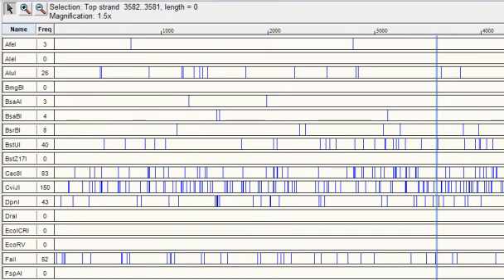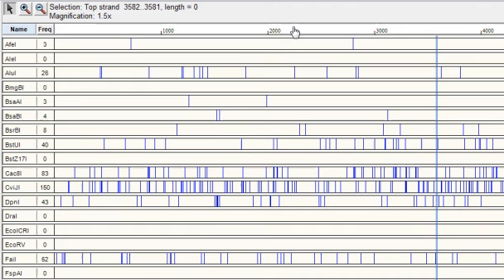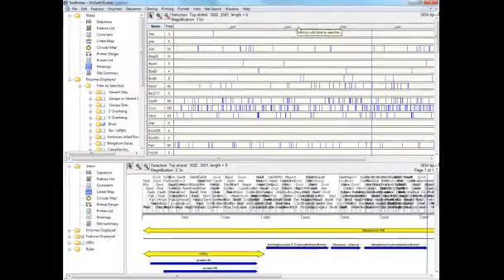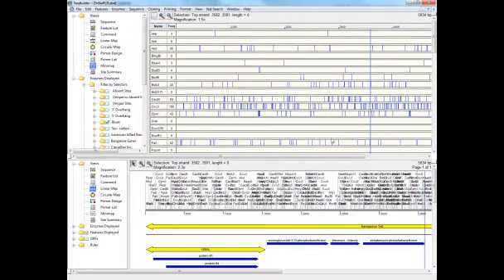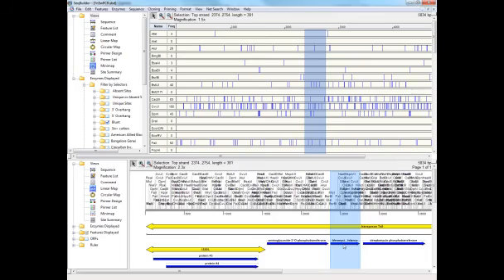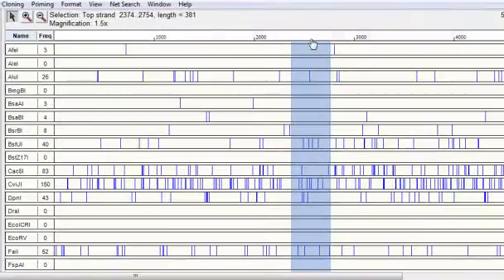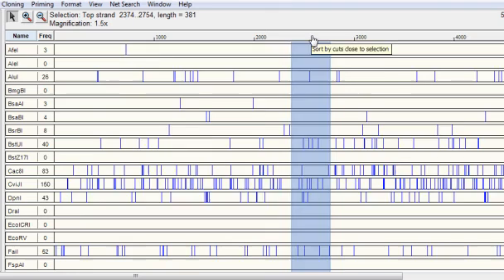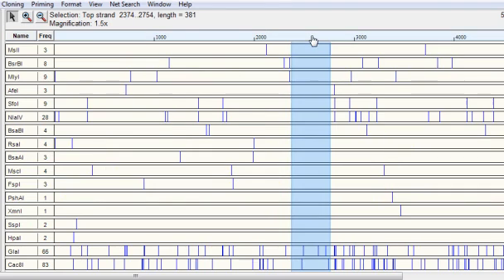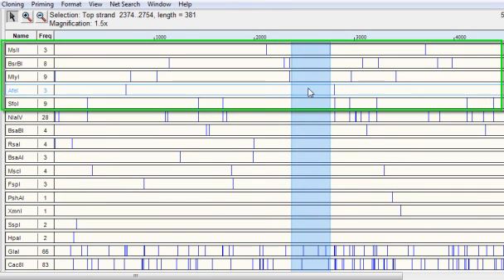You can sort the data in the minimap by clicking on any of these column headers. You can sort by name, frequency, and clicking on the column header for the ruler will sort by the enzymes that cut the closest to the existing selection. So if I select the range of sequence associated with this feature here in the linear map, and then click on the column header for the ruler, you can see that the enzymes up at the top cut very close to my selection.